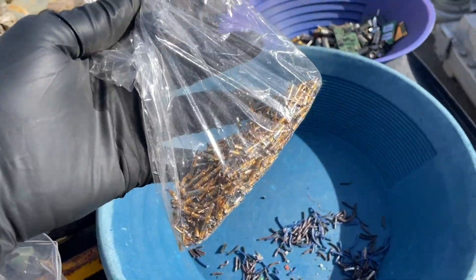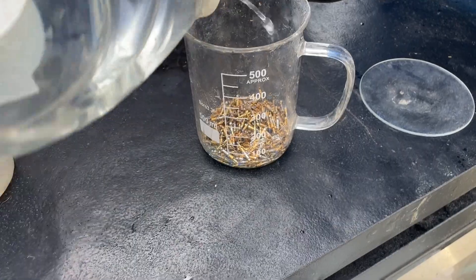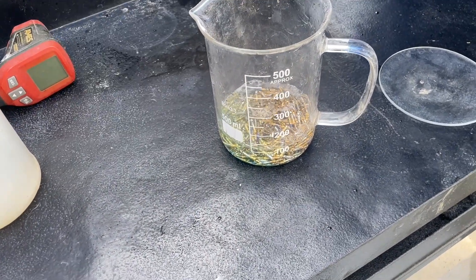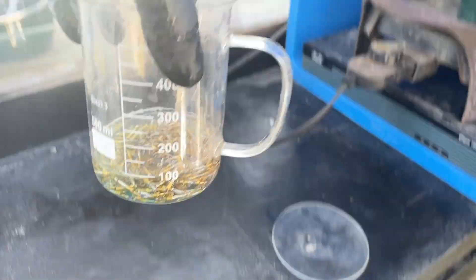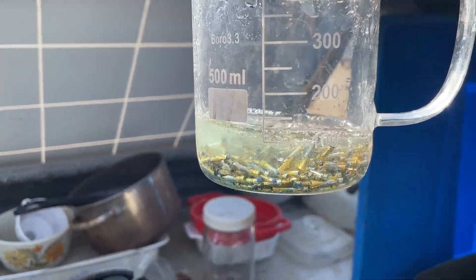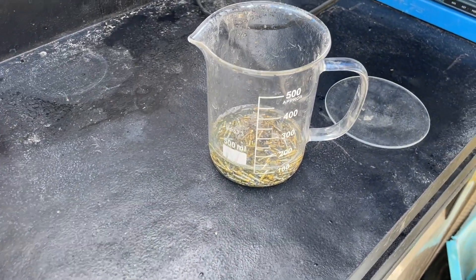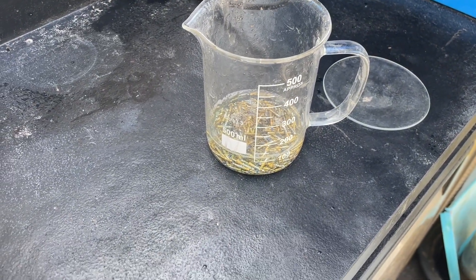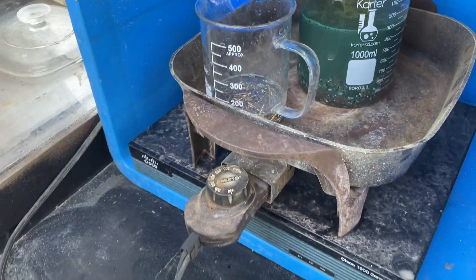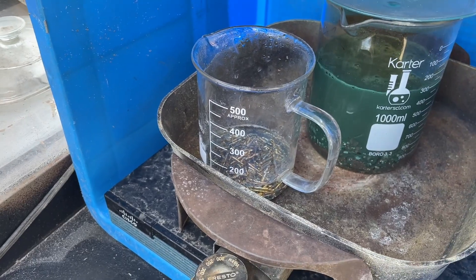Yeah, 109 grams. There they are. Taking on about 100 mL of water. That's actually — all those pins there is probably more like about 50 or 75 mL. Anyway, we're going to hit that with dilute nitric. It'll be diluted because we already have some water in there.